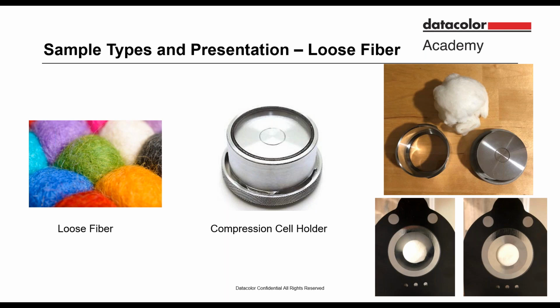It is recommended that we use the same amount, the same weight of the fiber each time. And it's also recommended that we measure the samples specular excluded to remove the glossy effect of the glass.